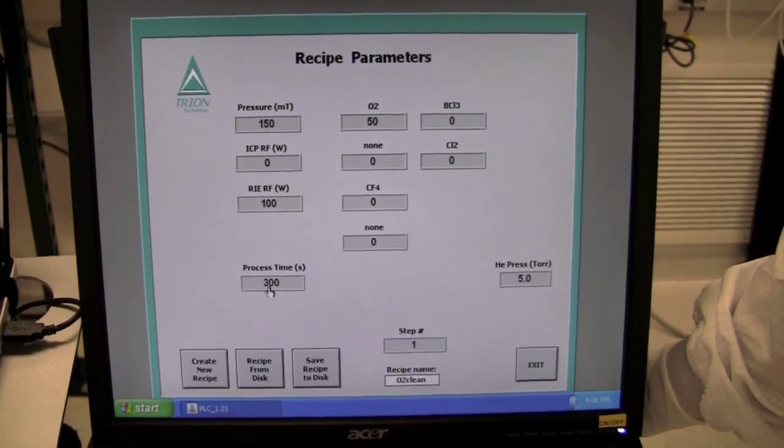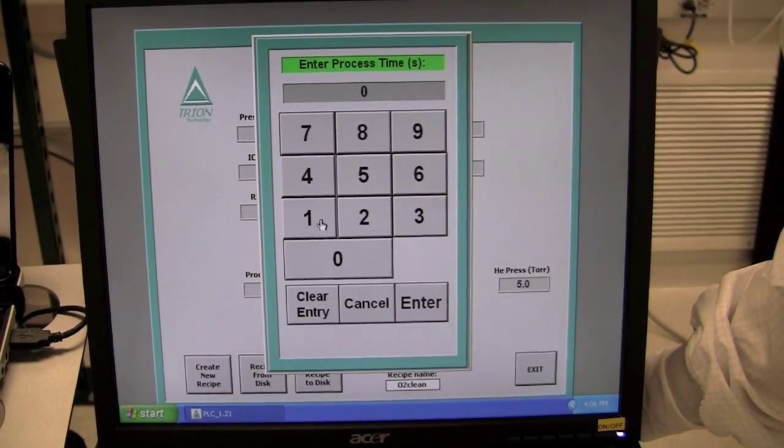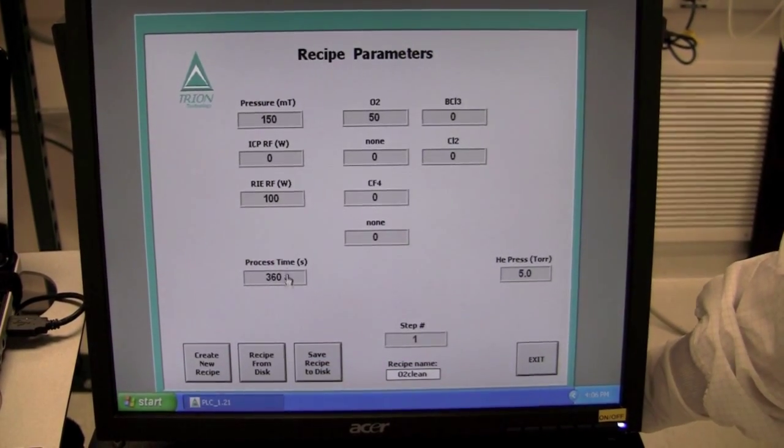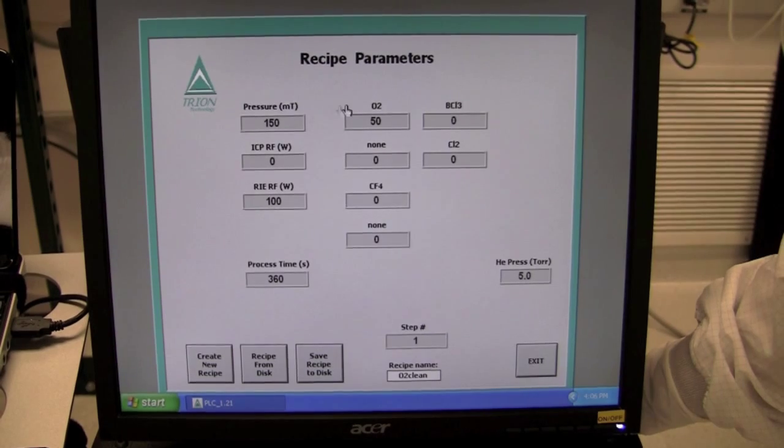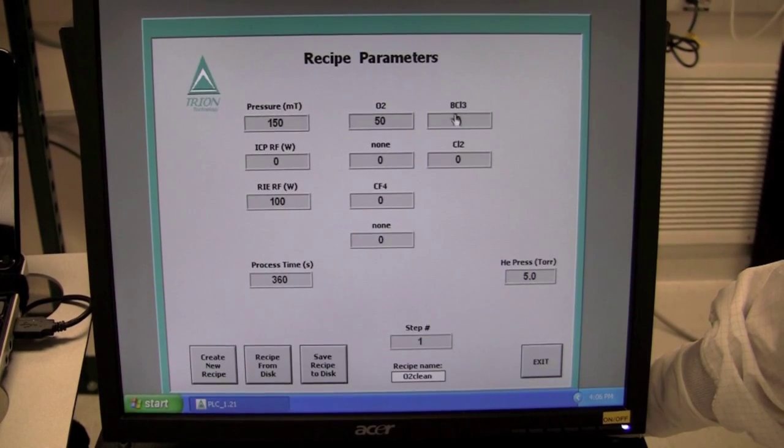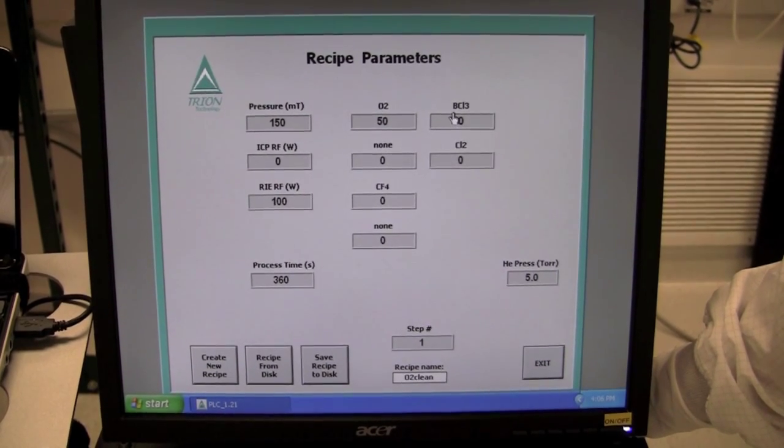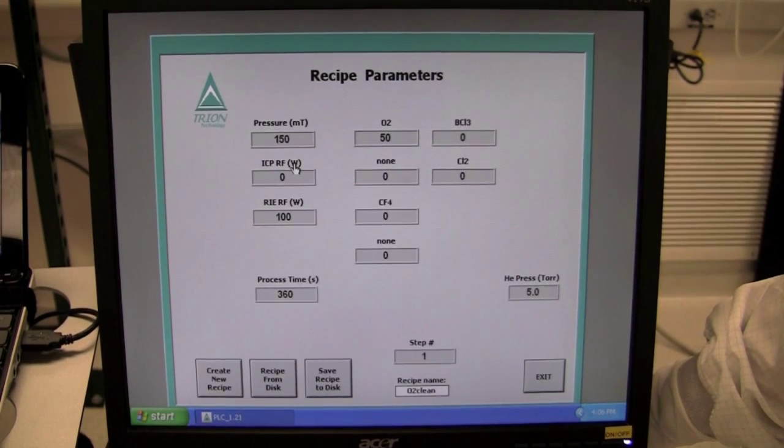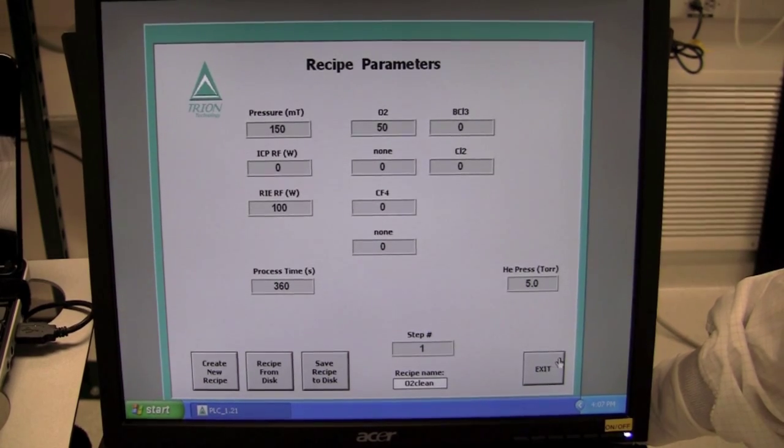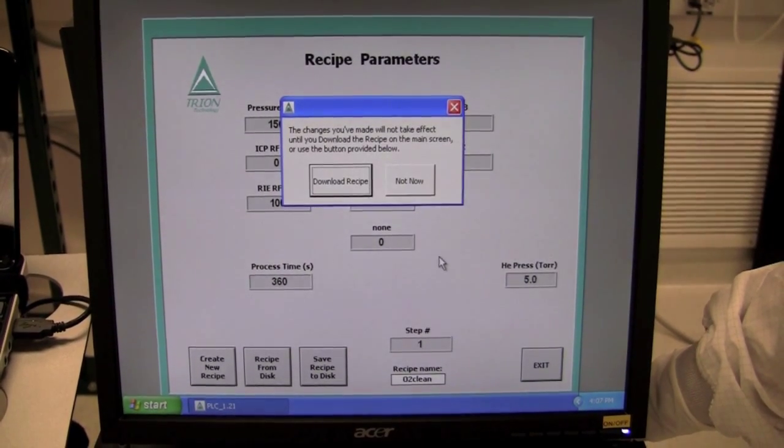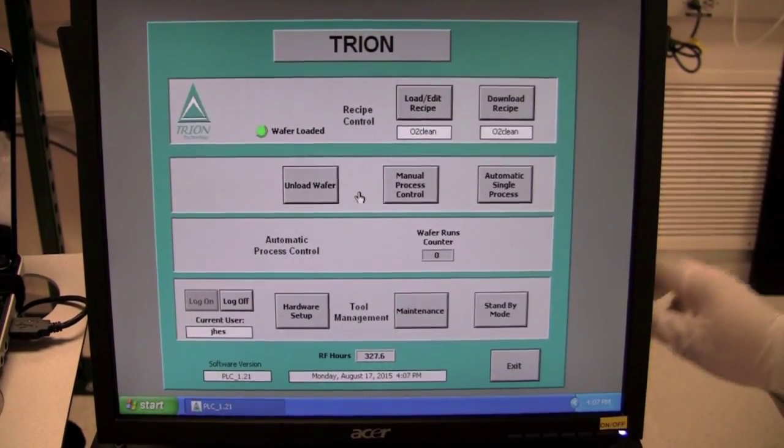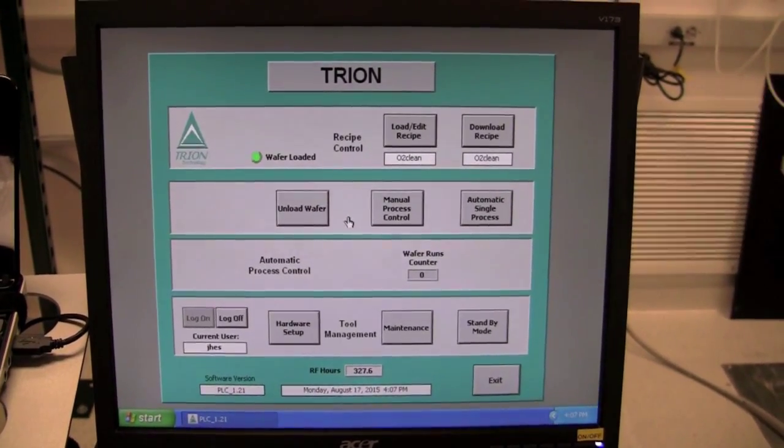So, for most users, we only allow them to change the process time. So, to do that, you click on the time itself and it'll give you a process time. You can re-enter it all you want. So, I'm going to say 360, enter, now the process time is there. We have a couple of other parameters as well. We have gas flows with oxygen, CF4, and a couple of chlorine gases that are not installed in the system. We also have a process pressure as well as ICP and RIE forward power. So, next we hit exit and we download the recipe.